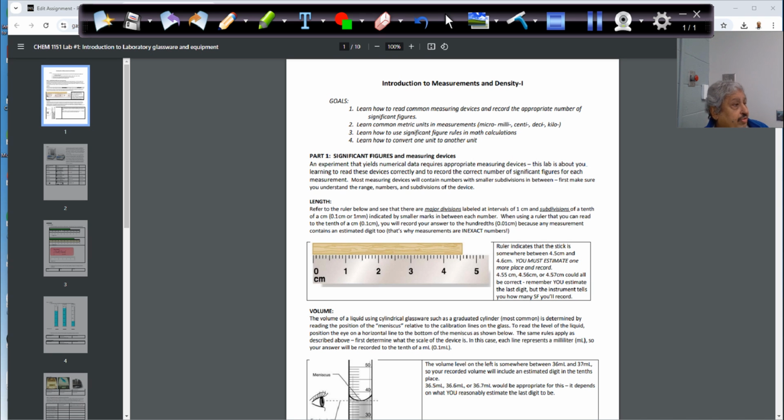The density of, as you see here, let me show you with the camera. Those are different steel, can you see it? You can see it here? Can you see it or you can't? So here it is, you can see it. Those are balls here. They are made of steel, used for bearings.